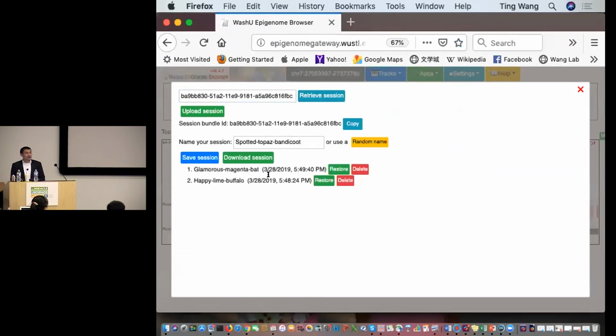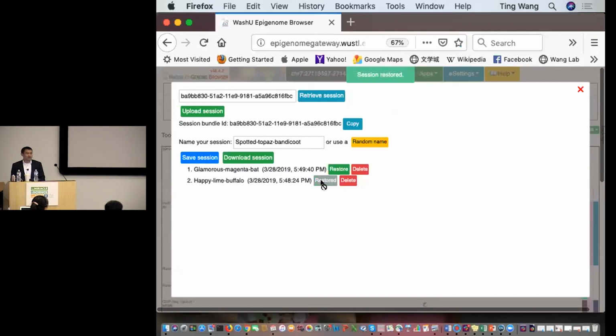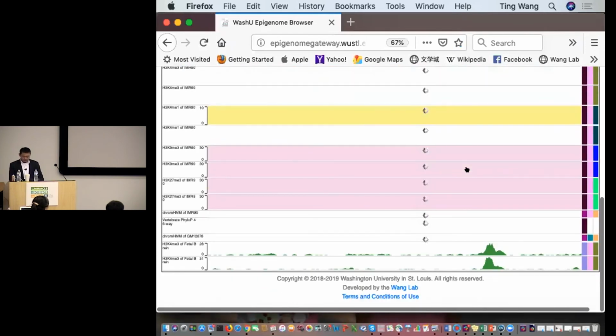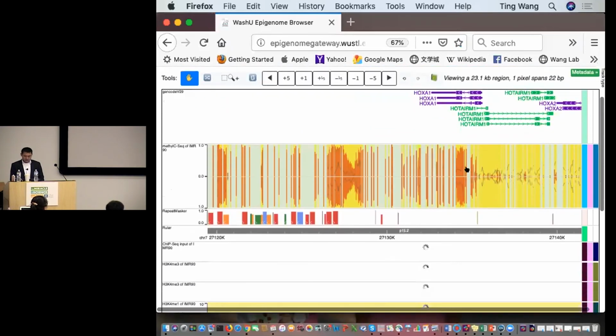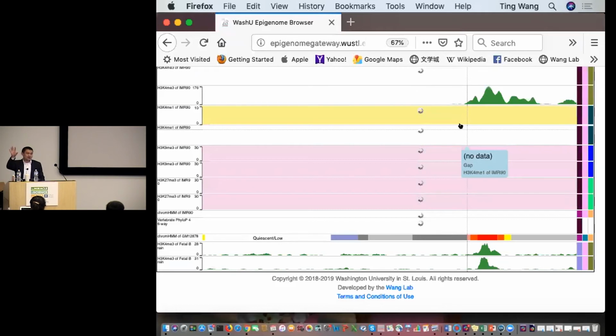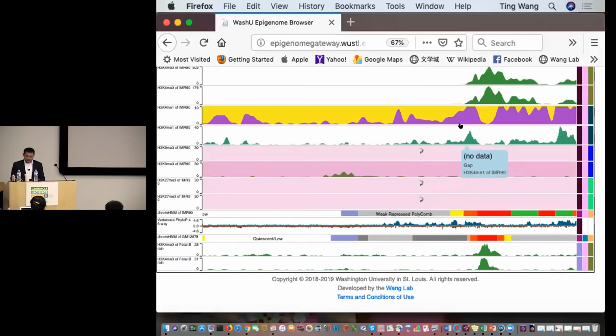Aha, I got my 2 timestamps there, right? So I can choose to restore any of them, okay? And check out what's going on in Firefox now, right? It's being restored. So this is all being restored. This is the first saved instance. Right? So this is something I hope, you know, pretty useful, right? So you work on your browser, you test different things, you save the sessions periodically with funny names, right? And then you can share this, recreate this easily.